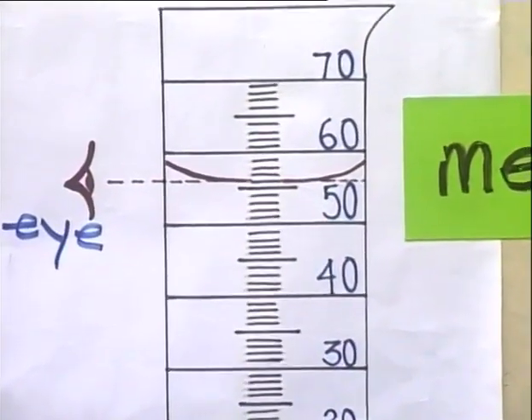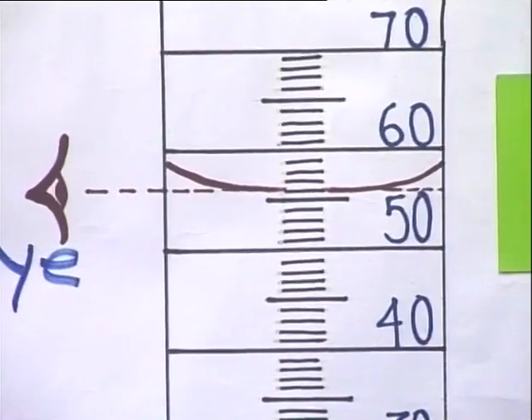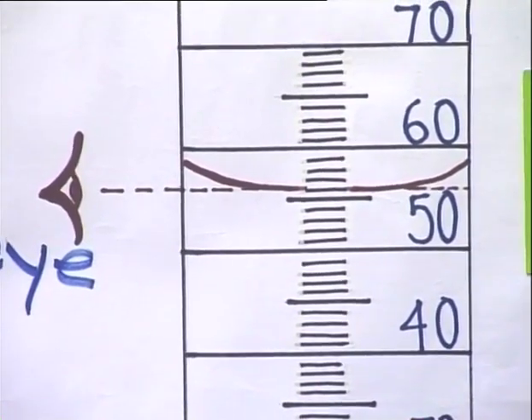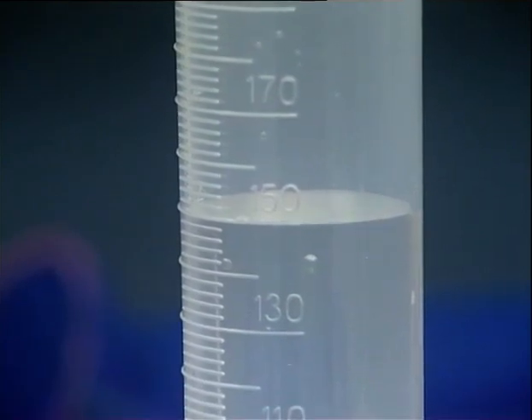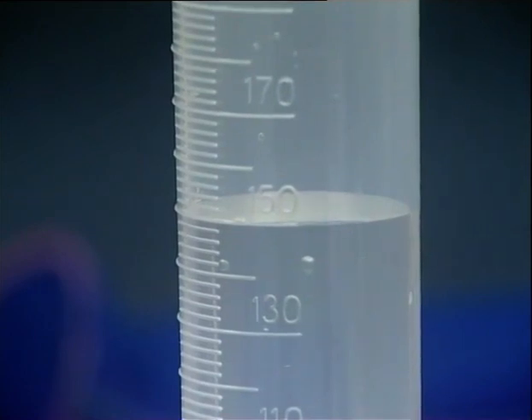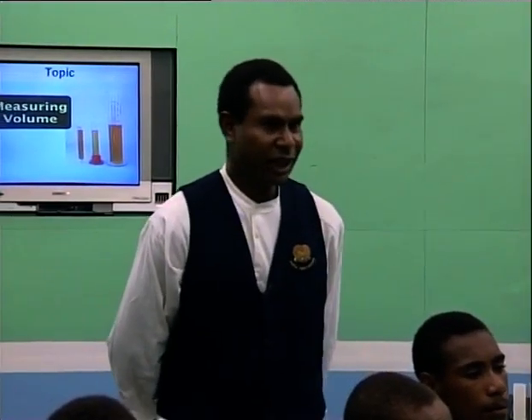So group 8, what is our reading for the volume of water that you have filled? Colin? 150 milliliters. Thank you, Callan.